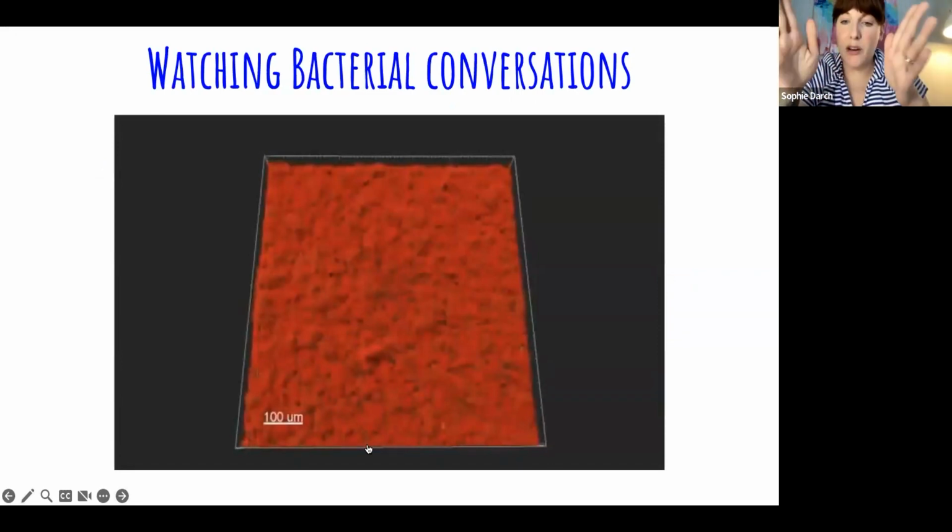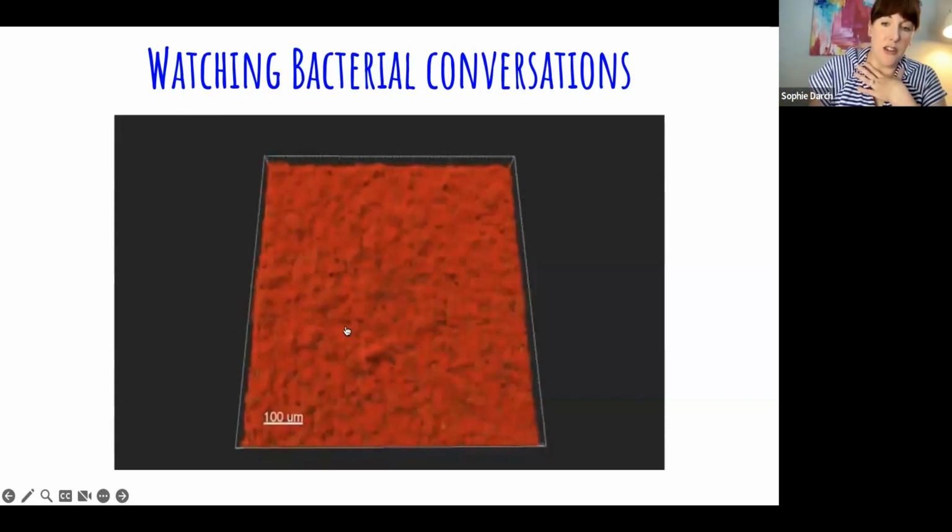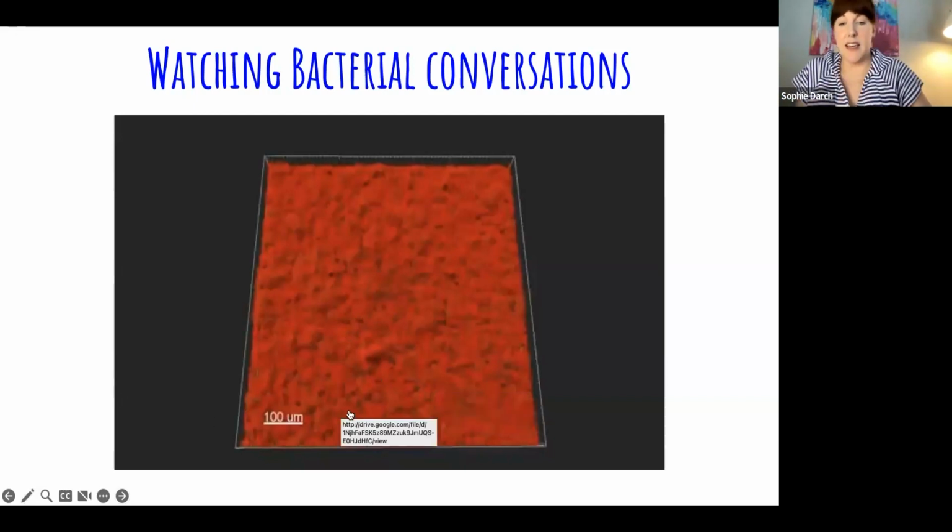So we can put a fluorescence protein in the DNA, and then it allows us to actually watch the bacteria start talking to each other. And so what we actually use is what we call a fluorescent reporter in the lab. And this video I put in is to show you how we can see here in red, you'll see this is just a very dense or full bacterial culture in red. And then what you're going to see are little spots of green pop up. And where the green is, is where the bacteria are actually having conversations and talking to each other. So that's where they're quorum sensing.